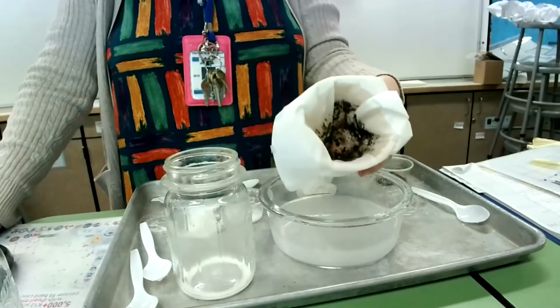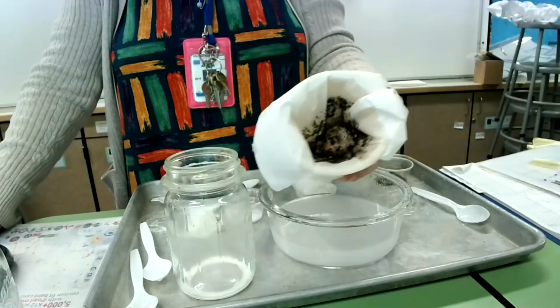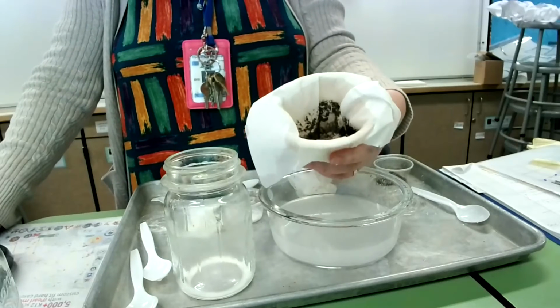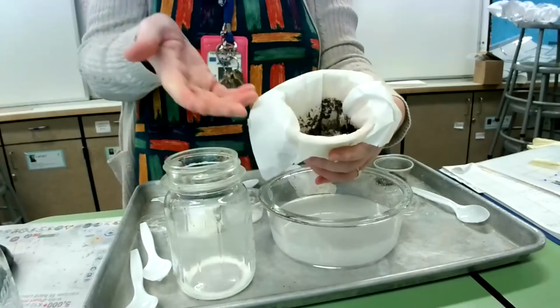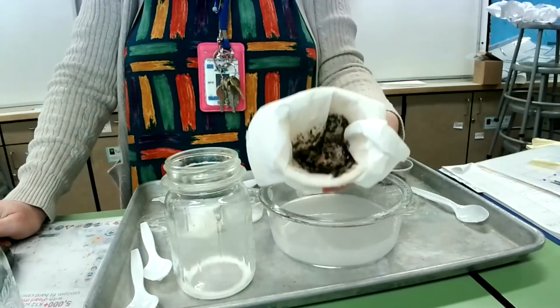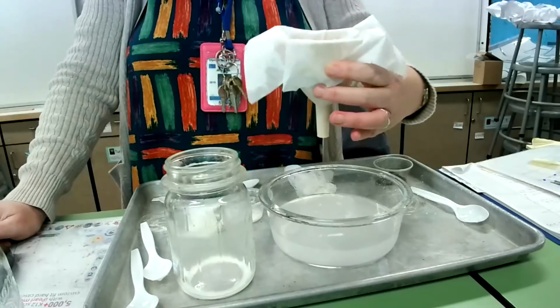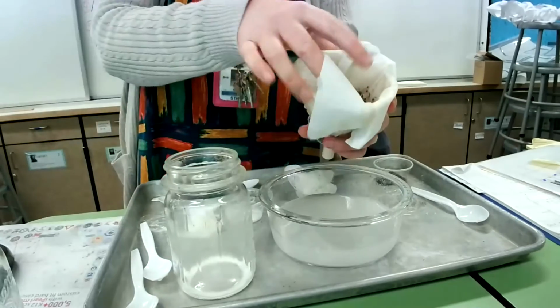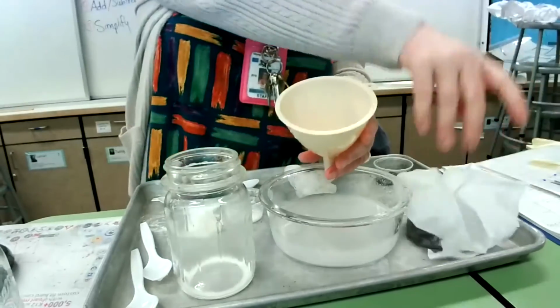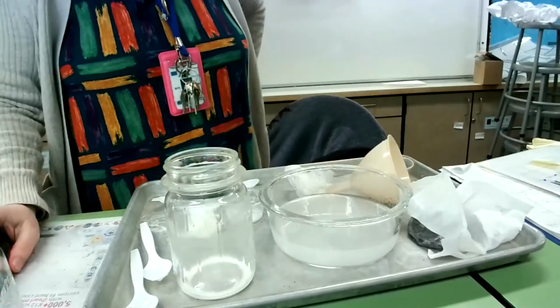And this is one way that you can get non-solvents, okay, substances that don't dissolve in the water. This is one way you can separate them out from the things that do dissolve in the water, is you can use a filter. And I just used a paper towel and a funnel, okay, and it got all the soil out of there.